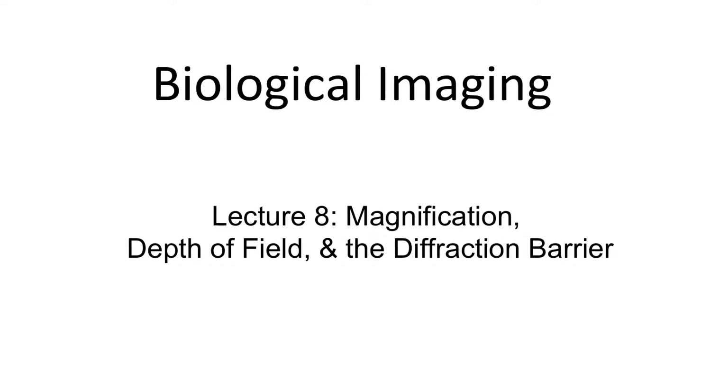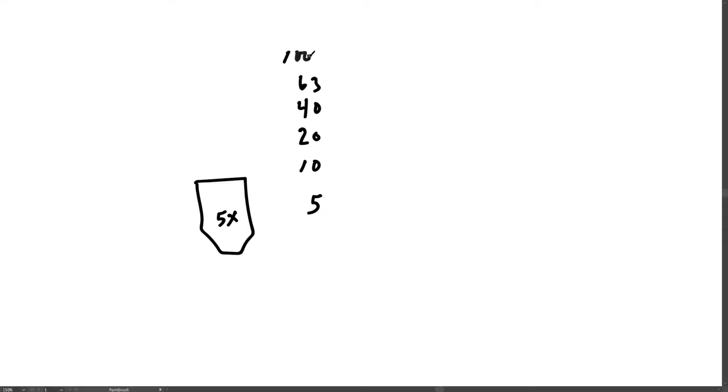We've talked about microscope objectives before a little bit, and there are some typical magnifications like 5x, 10x, 20x, 40x, 63x, and 100x.